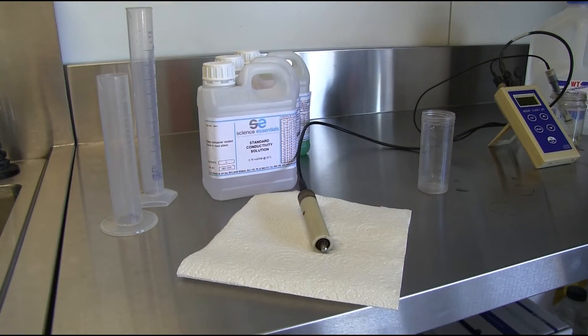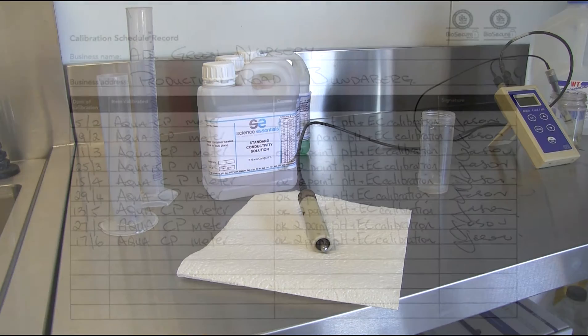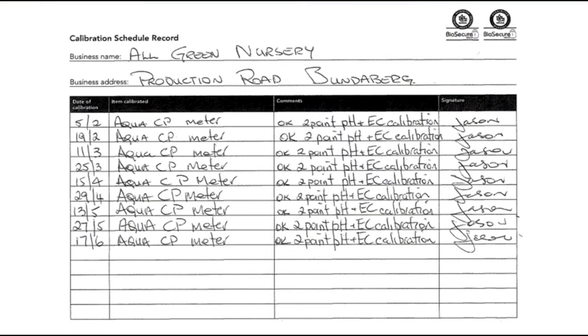For a zero EC calibration, allow the sensor to air dry and calibrate as per manufacturer's directions. At the completion of calibrating the meter, record the results.